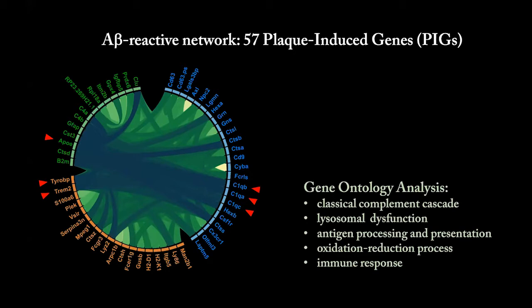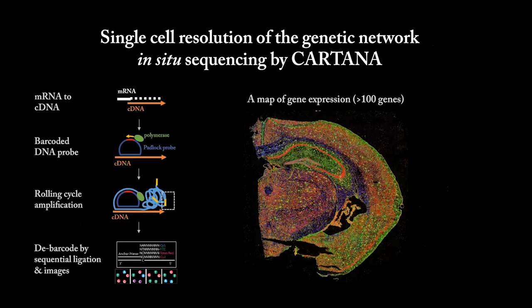So spatial transcriptomics tells us the novel network and the targets we should focus on. However, it doesn't have single cell resolution. So we incorporate other technology. We want to know which cell expresses the target, which will help us with further target validation and experiments.